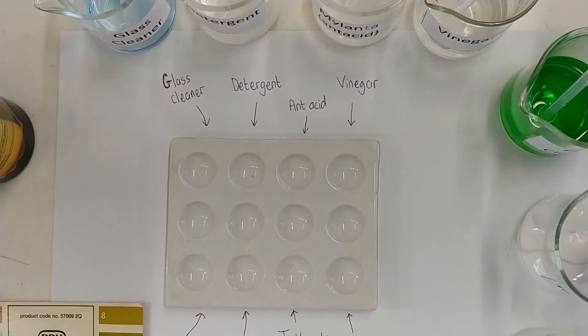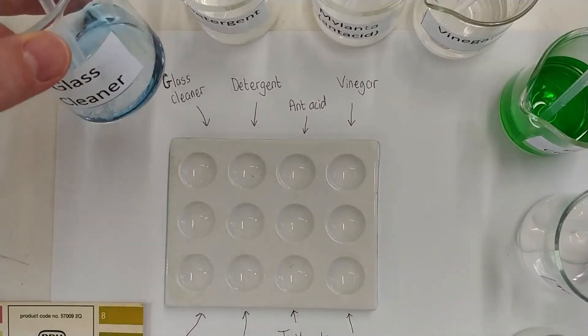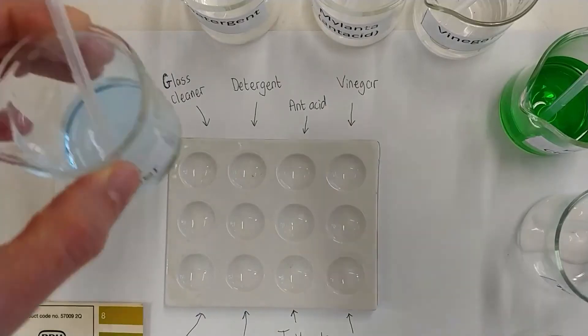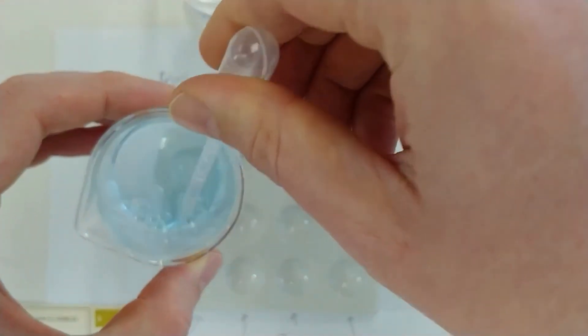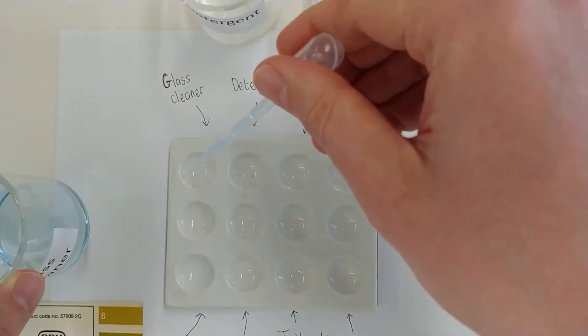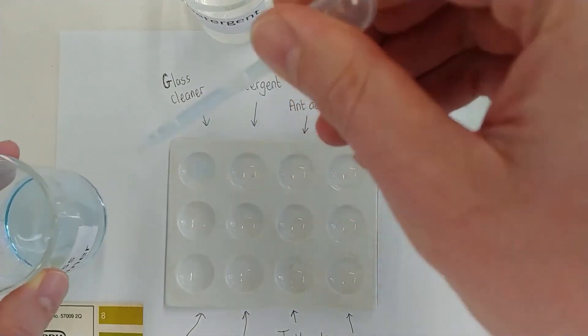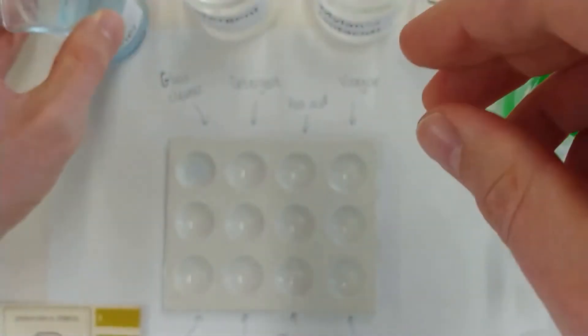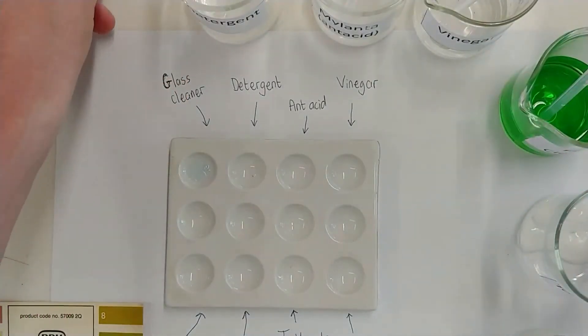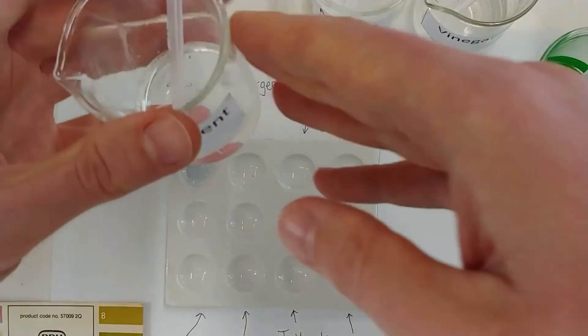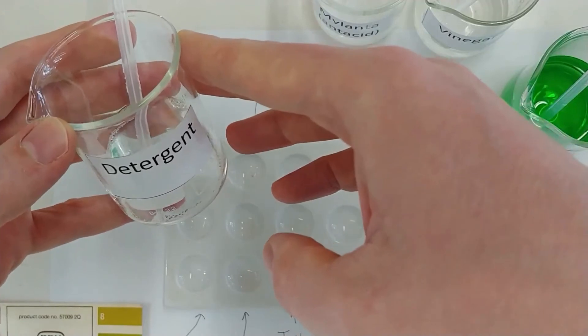Well, let's see how well Mr. Archer does the Universal Indicator experiment. Here you can see he's collected certain chemicals. Glass cleaner in this case. You may notice, despite the safety video, one of the requirements has possibly not been met.